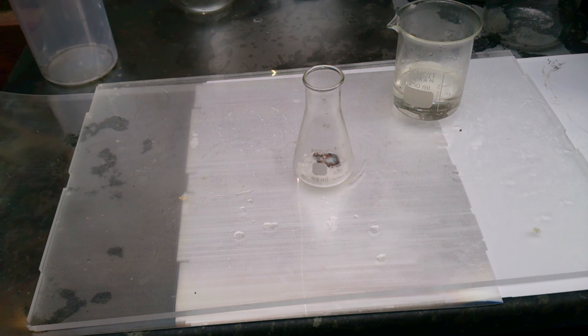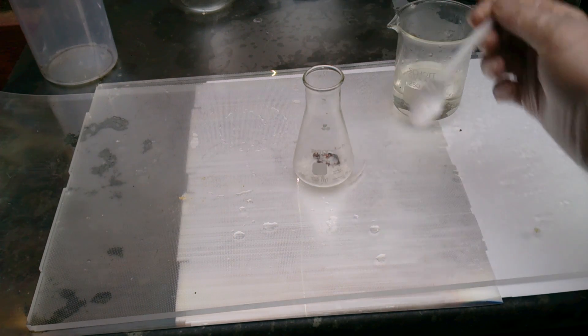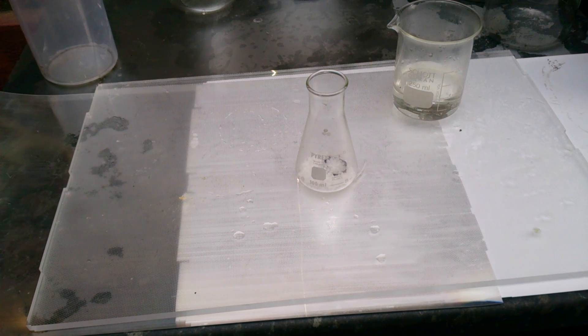From a practical point of view, it will just be less reactive, and that's it - no other major differences. So whatever applies to proper aqua regia will apply to Poor Man's aqua regia as well.